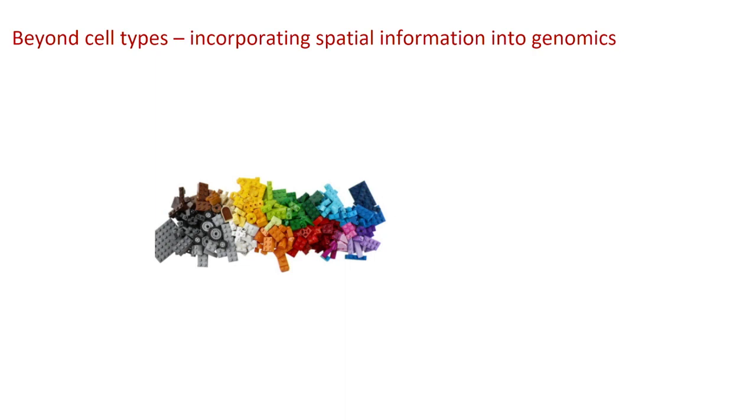But what's really next, I think, and what's going to be discussed in the next talk, is how do you take all this information and put it back into a spatial context? I think that's the next big challenge for single-cell genomics, apart from continuing to develop the methods and make them even more robust. The big conceptual challenge is how do we take single-cell genomics data and put it back into a spatial context?